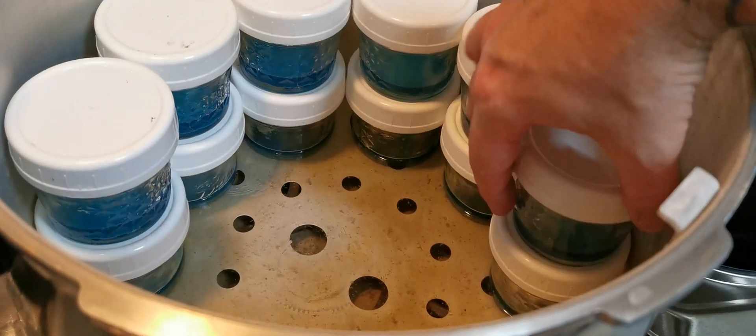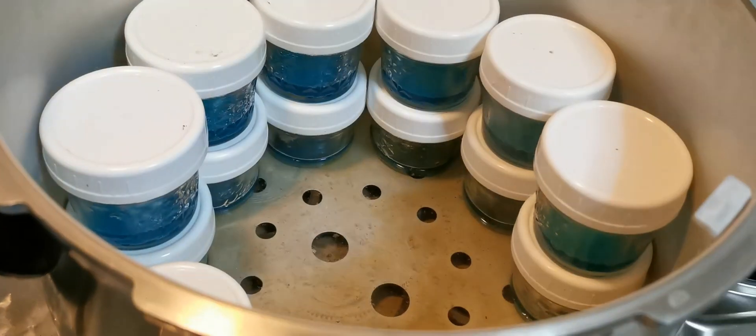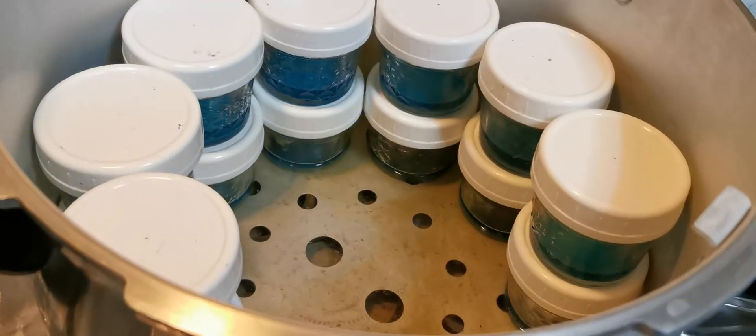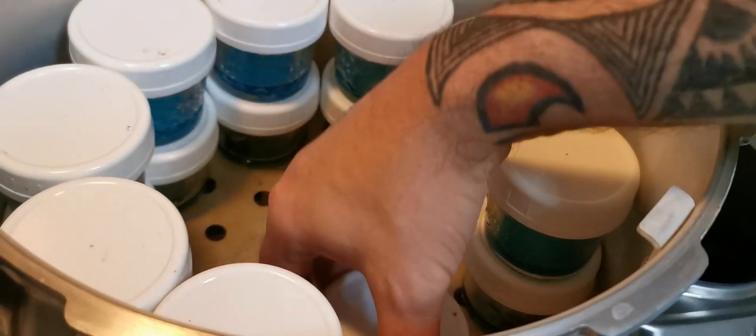Once we do have all our jars loaded, we'll close it up and let it run for 30 minutes from the time the steam starts venting at the top. Then we'll turn off the heat and let it cool down slowly until it depressurizes and unlocks.